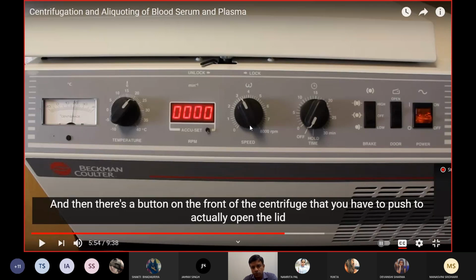So these are the normal centrifuges. Beyond this, there are ultracentrifuges, ultra high speed centrifuges, right? In those centrifuges, the RPM can go very high, and if you are looking for very small components, for example if you want to settle down some viruses or something, then you may go for ultra high speed centrifuges.